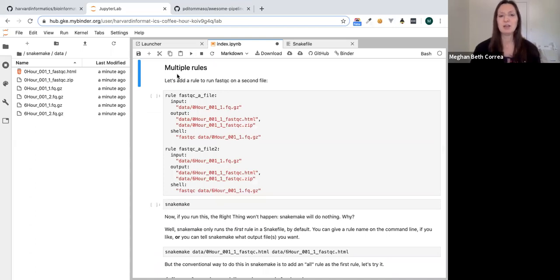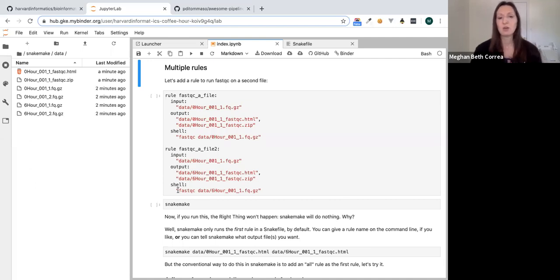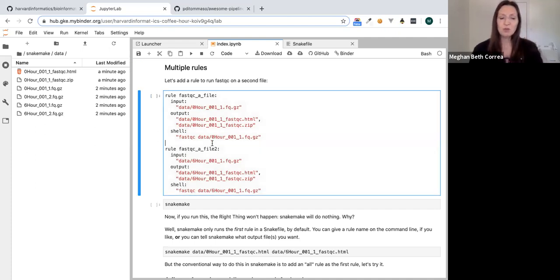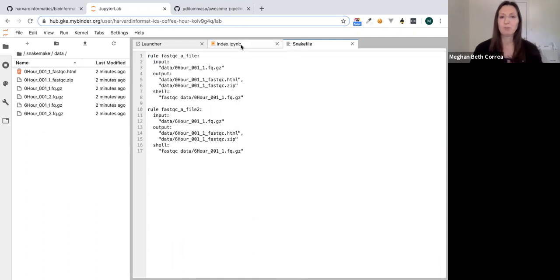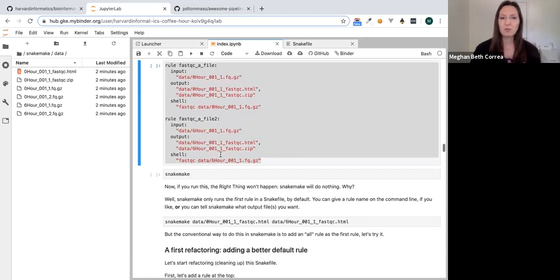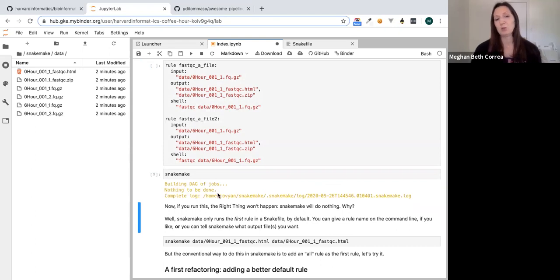Let's add a second rule. We have a six-hour data file, so I'll add a second rule fastqc_a_file_two where the input is the six-hour file and the output is the HTML and zip FastQC files, with a FastQC shell command on that file. But if we try to run that, it still says nothing to be done — which demonstrates one of the early pitfalls with Snakemake.